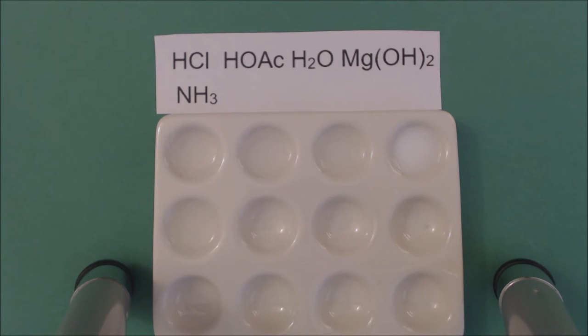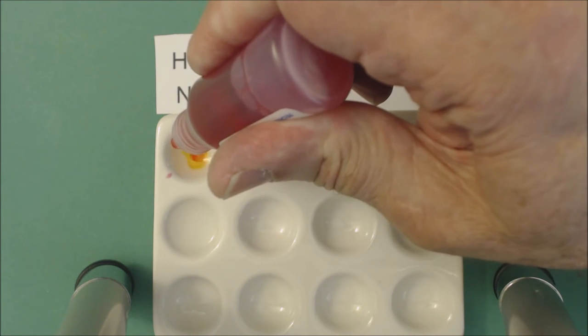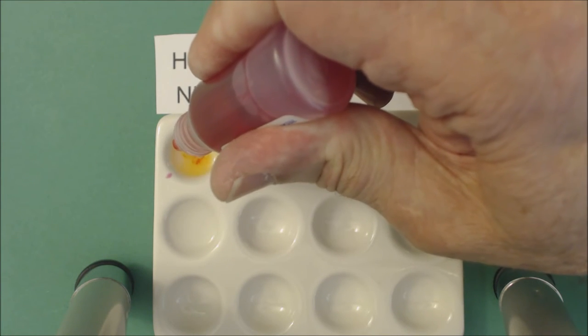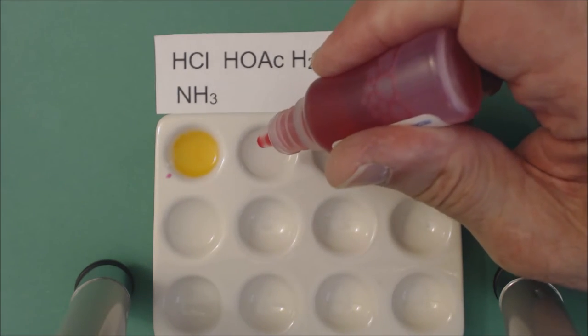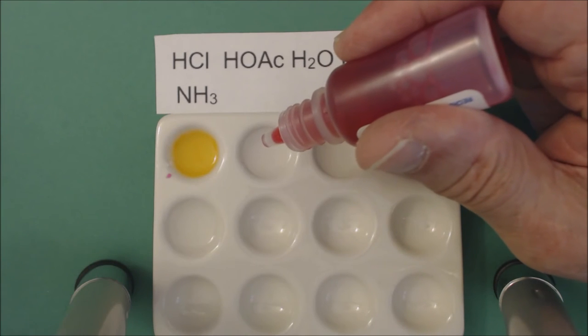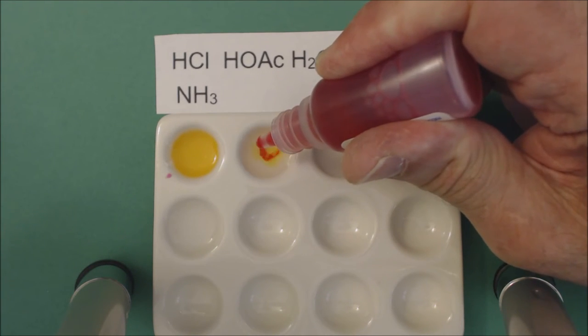I'm going to add five drops. You can see it's yellow. By the way, 0.1 molar hydrochloric acid is about like stomach acid. This is vinegar.